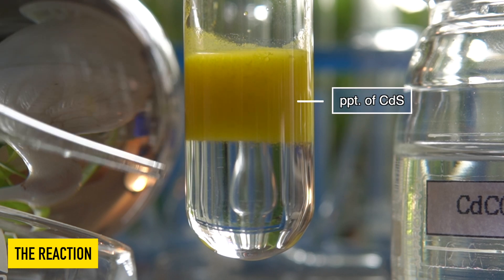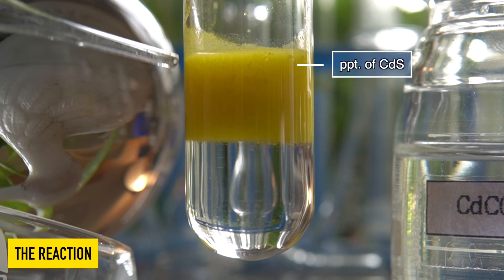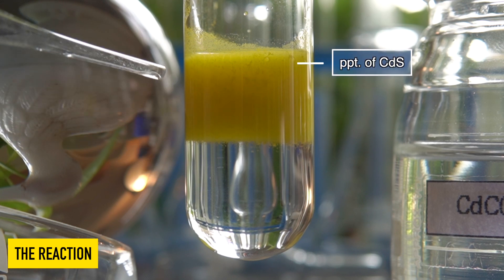The yellow insoluble precipitate that has been formed inside the test tube is nothing but cadmium sulphide.